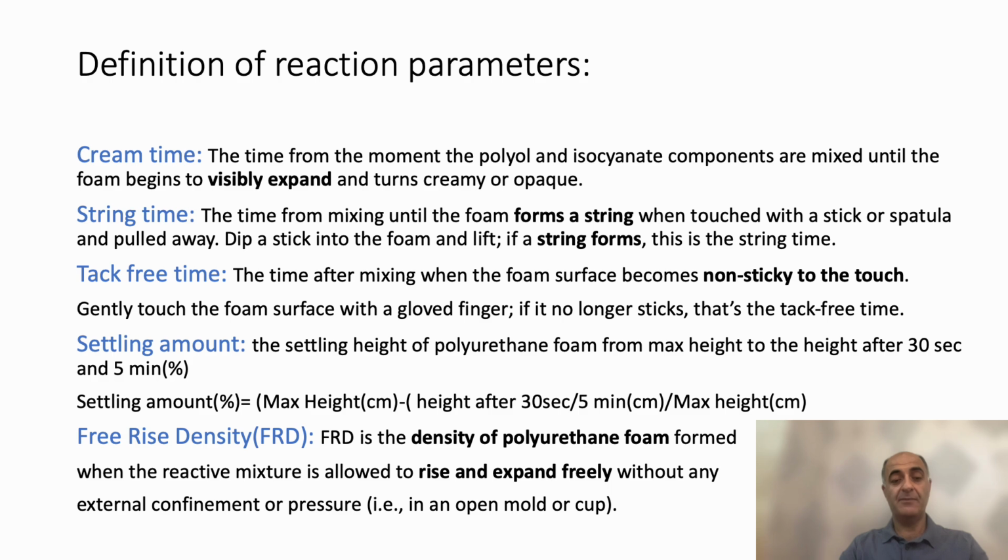The larger the settling amount, the more openness of the foam it indicates. So this parameter also should have a limit in the lab to have a proper system.